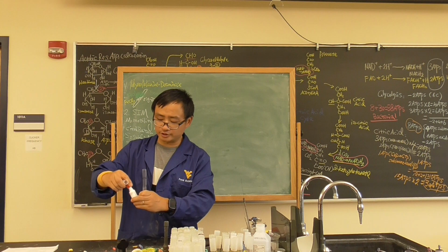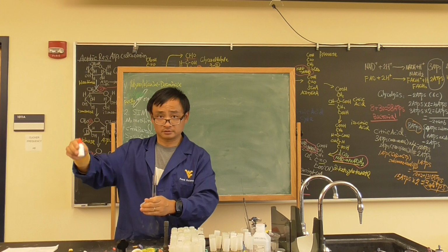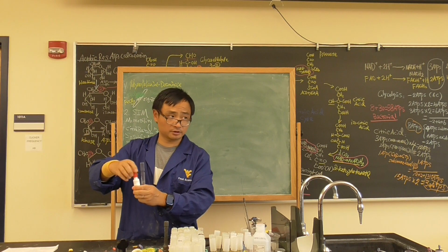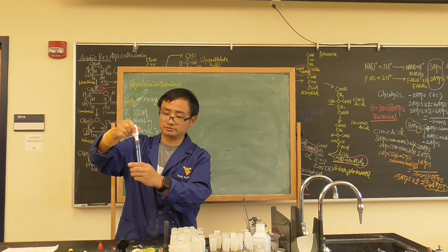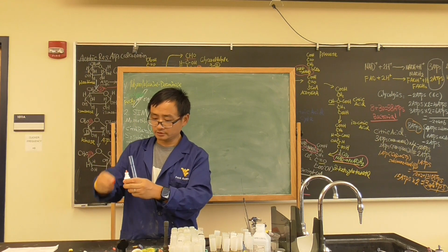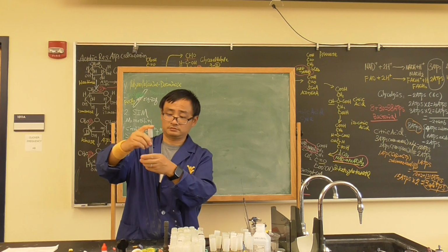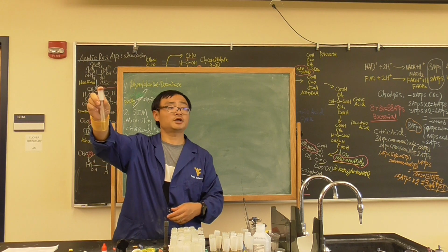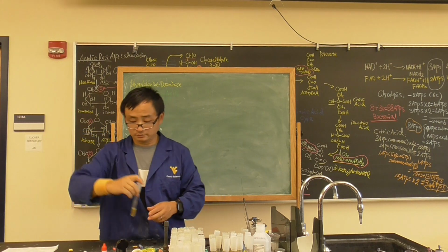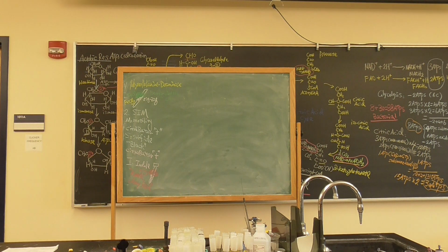Now, remember, all these reagents have been there for maybe 2.5 years. Shake. Okay, everything is going to be at the bottom, the precipitation. Same thing, add a drop. 1, 2, 3, a couple of drops. I don't know whether it still works, hopefully. So this is not E. coli, because there's no cherry red. See, I tested it. How many points is that? Oh well, maybe another 10 points.